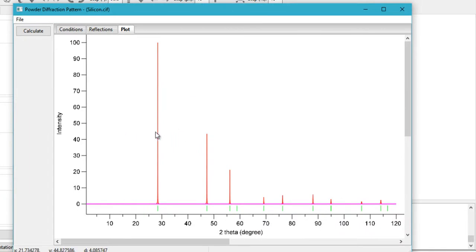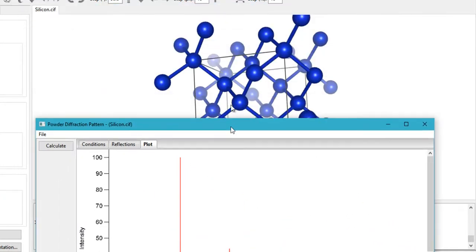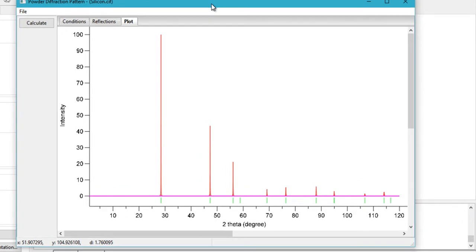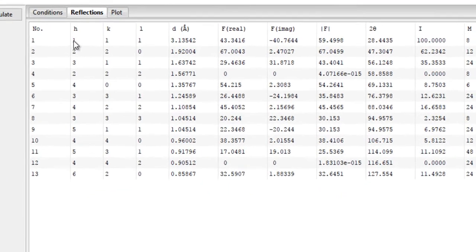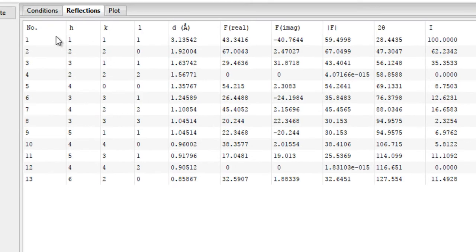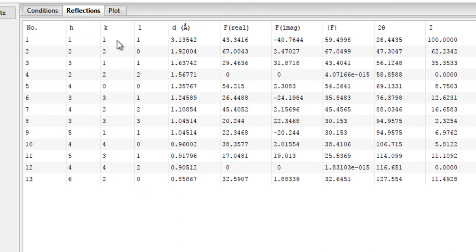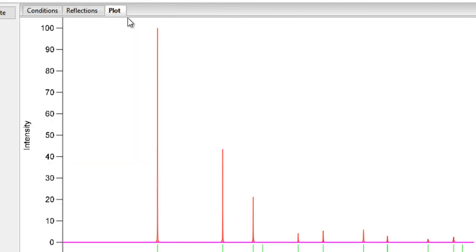When you go to the Plot, you will see that it has simulated an XRD pattern for your silicon crystal. To get more information about this, you can click on Reflections, and here you will have a lot of information like the HKL plane of all the peaks. All the HKL indices, that is Miller indices, for all the planes corresponding to all the peaks.